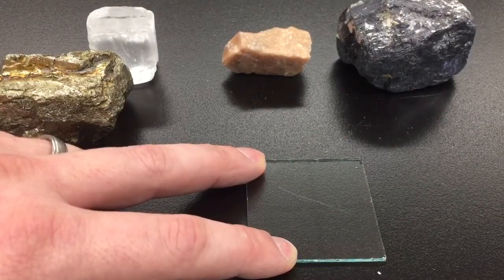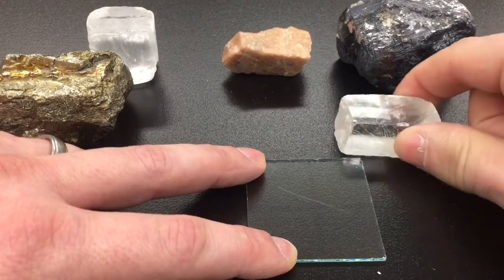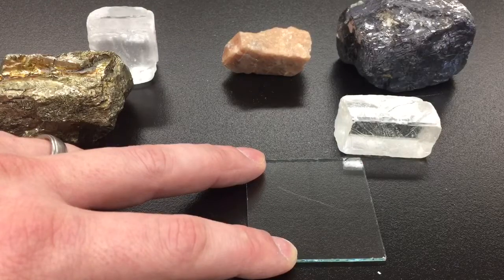Notice that the powder that was there before is now gone. That is not a scratch in the glass, so this sample is not as hard as glass.